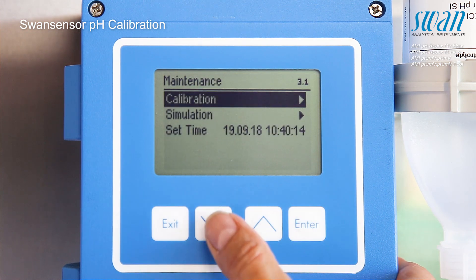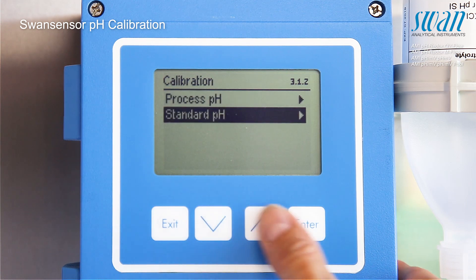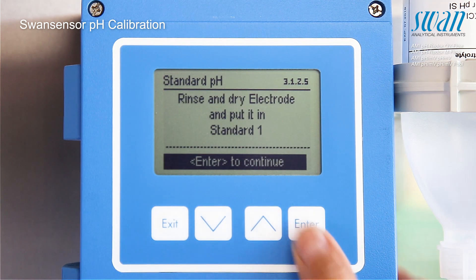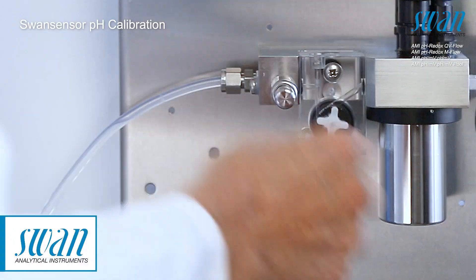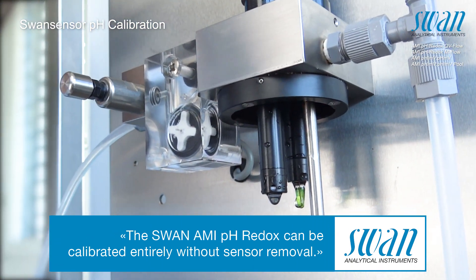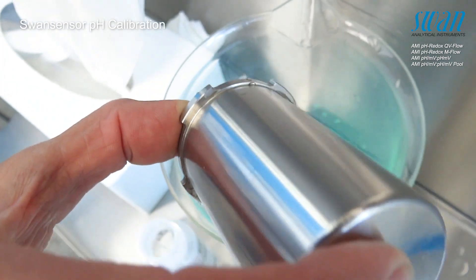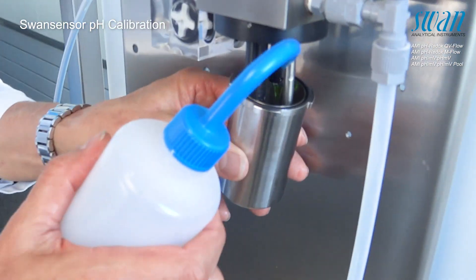The pH standard calibration procedure is menu guided. Detach the vessel from the flow cell by turning it slightly and discard its contents. Keep in mind that the O-ring is only slightly fixed to the vessel and should be held in place when the vessel is tipped over.